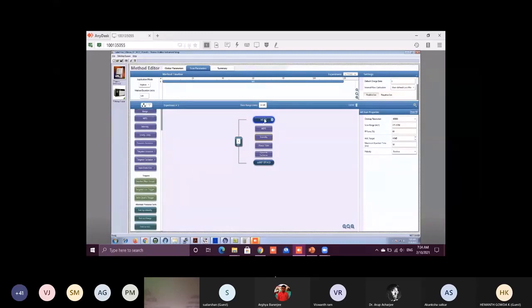So in the MS Orbitrap mode, whatever the default charge state is, set to 1, here you need to define the parameters. Here we are using an Orbitrap resolution of 60,000, but it is capable of going to 5 lakhs. You can see around 2.4 lakhs, and here it is 5 lakhs of resolution. The scan range we are using is from 375 to 1700.